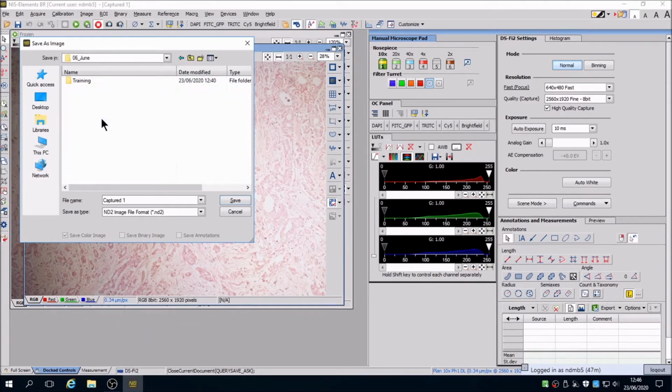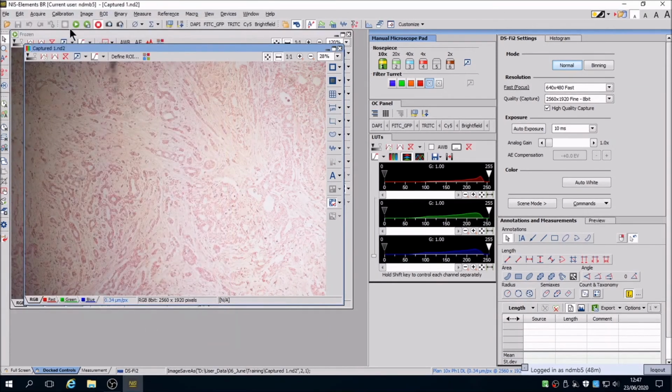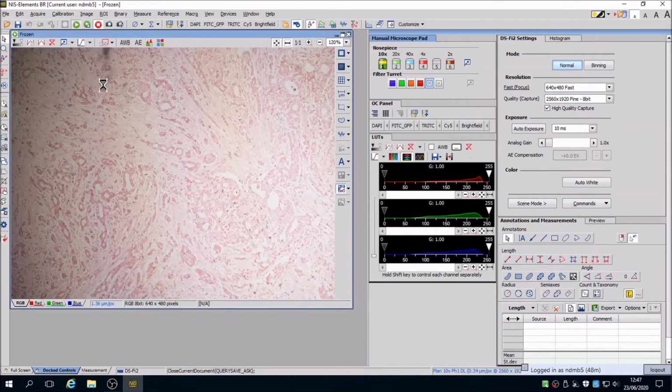When the image saves, you can see the details of the metadata contained within the file, embedding lens, illumination, exposure time, and scaling into your file for reference. Once you have saved the file, you can close without warnings. However, if you attempt to close an unsaved image, you will be prompted to save or discard the image.